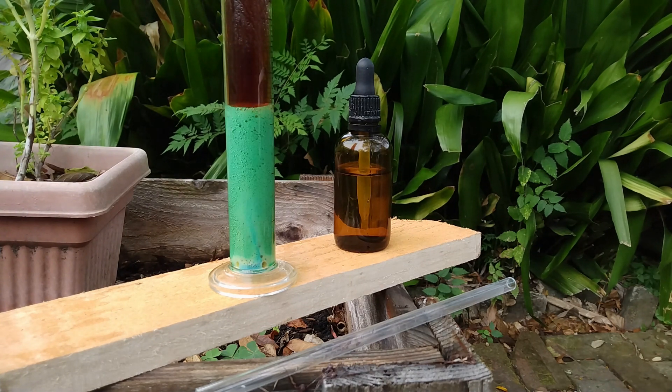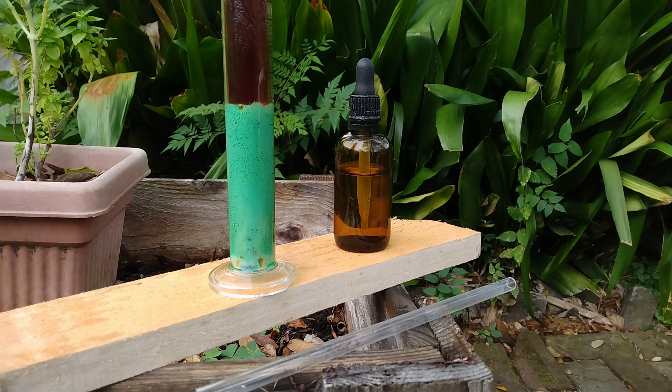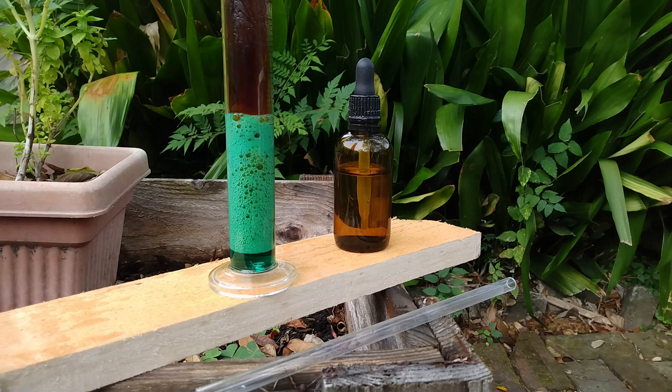Sorry for the noise outside — it's always the case that each time I want to make a video, the neighbors decide to make as much noise as possible. And there we are — look at this beautiful residue.